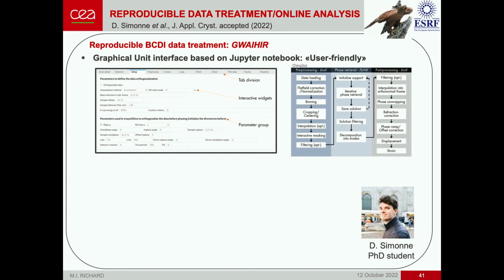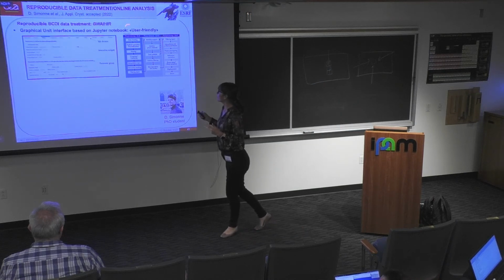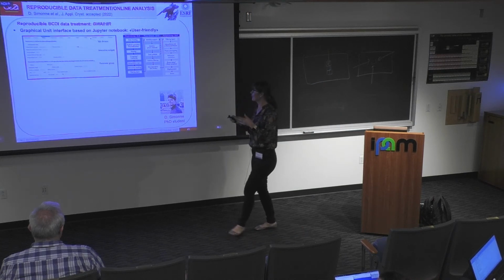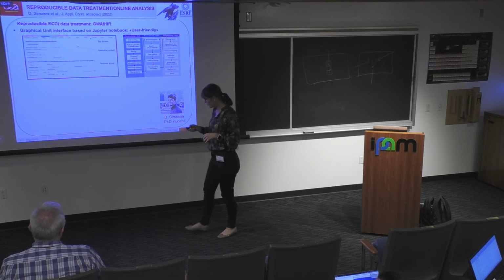In just one notebook, we can do the pre-processing, the phase retrieval, and the post-processing. It's going very fast, and we are trying to do online analysis and everything.